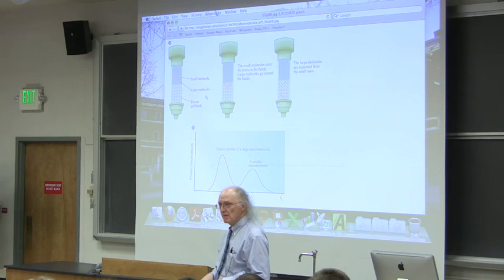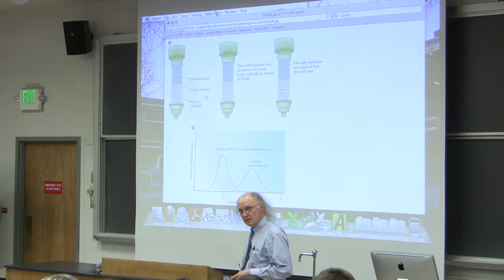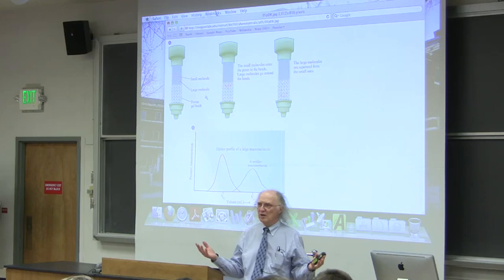Okay, so the question was, if I run this experiment, is it time sensitive? Well, it's time sensitive in the sense that the buffer is flowing through at a fixed rate. So it is time sensitive because this is going to come out after a certain time or a certain volume, and this is going to come out at a different time or a different volume. Does that make sense? So what I would typically do if I did one of these columns was I would run it, and then I would run it for a real long time afterwards to flush everything out and make sure there wasn't something in there so I could go back and reuse the column.